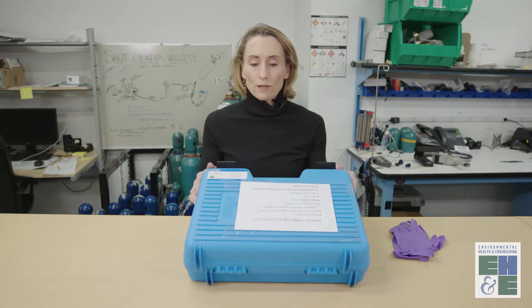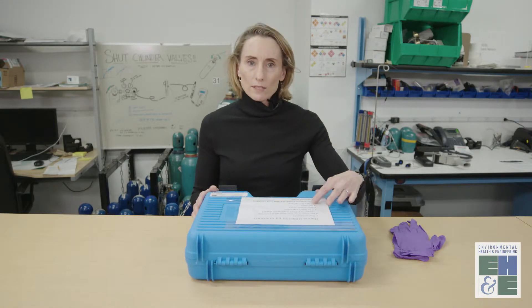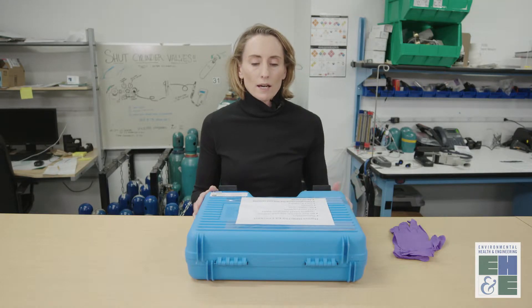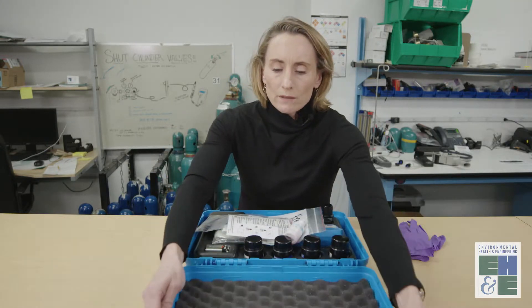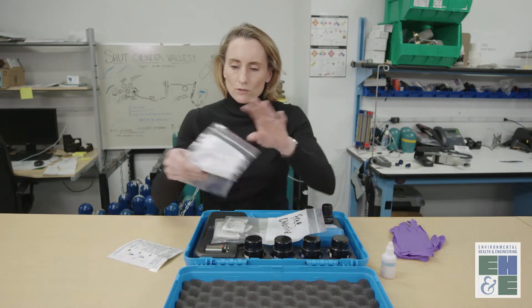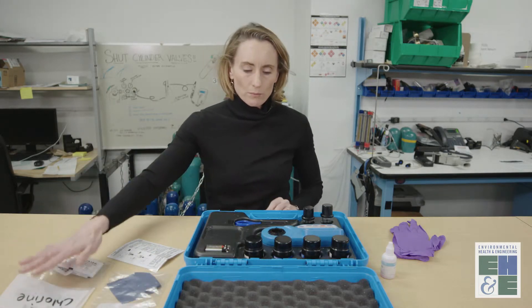First you want to get your Hanna kit from the FOSC and check the list of supplies that should be included in the kit. And then when you open the kit, you'll have instructions, you'll have a microfiber cloth, and these are your reagent packets.